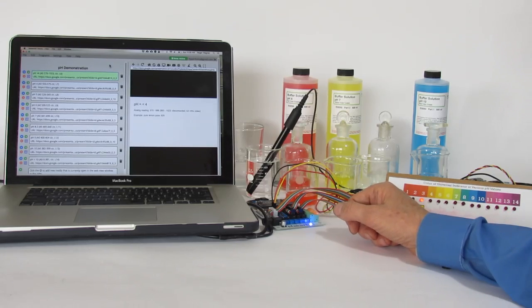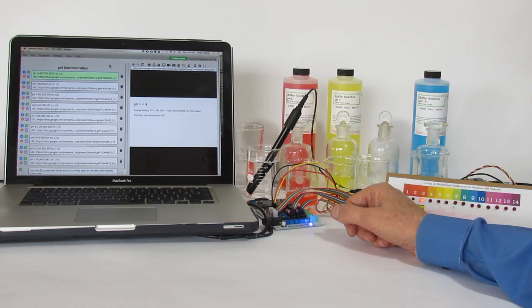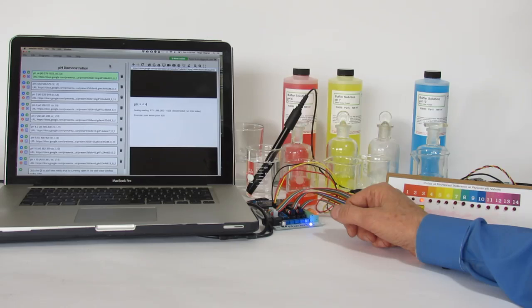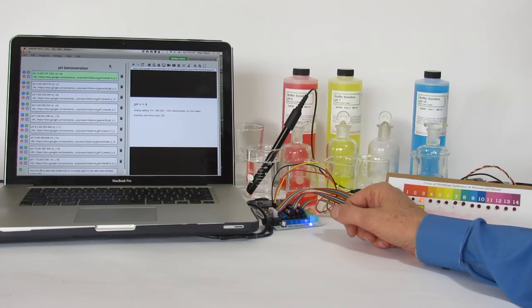We're going to use an app that runs on Mac, Chromebooks, or Windows machines called the MakerBit Media Linker.